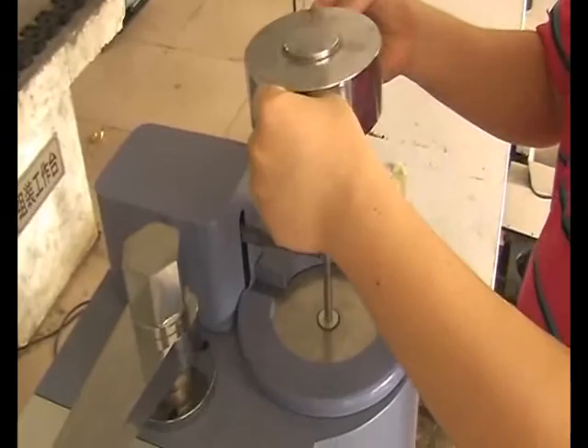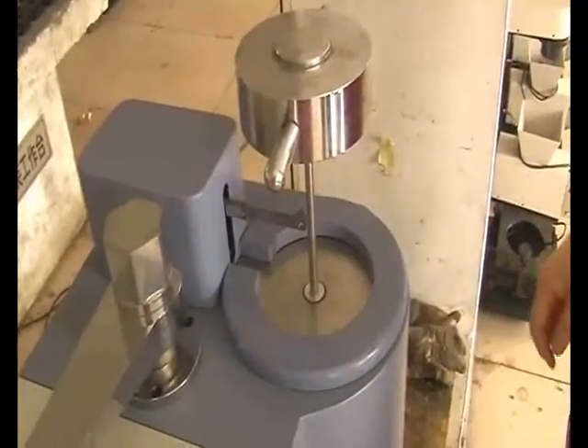Now let's lay up the weights after 4 minutes, then press the menu key to start the test.